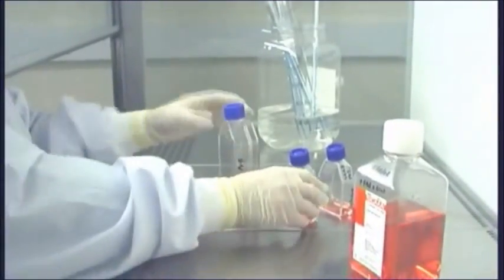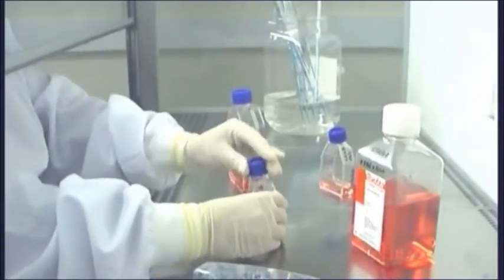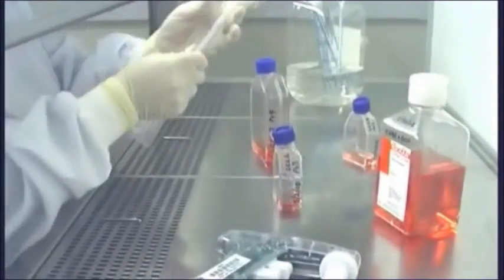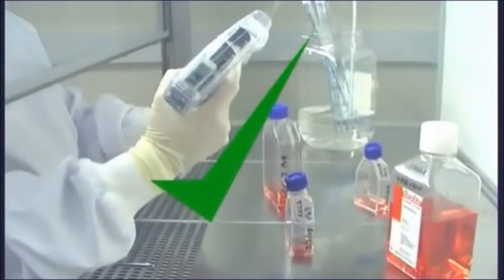Aspirate liquids rather than pouring wherever practicable. Pouring can be acceptable when transferring larger volumes or when aliquoting reagents.